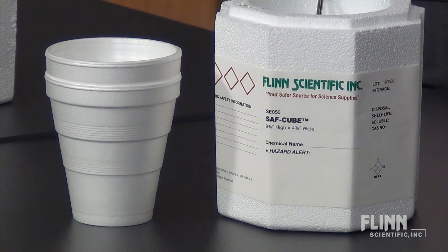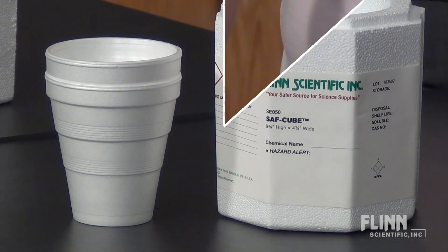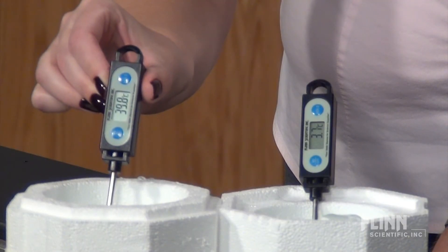If you don't have a hot plate, you can use hot tap water. Insulated foam cups or a safe cube can help to moderate the temperature. Keep a thermometer in this setup to ensure the temperature doesn't drop too far during your experiment.